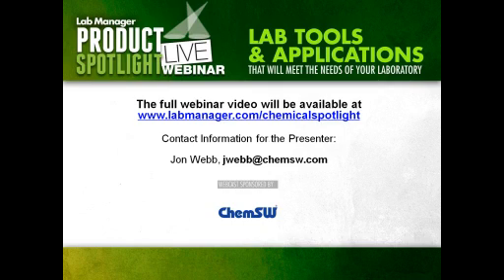Yeah, I agree totally. John, there are so many questions regarding what to do when the MSDSs are not available. We have somebody from Nigeria saying we have all these chemicals that come to our lab which are often repackaged and sold without MSDSs. So what should I do? There's a person asking about new molecules that have no associated MSDS documentation. So I think a lot of people are facing this challenge where there is not a relevant MSDS that comes along with the product. What is your general recommendation in all these cases?